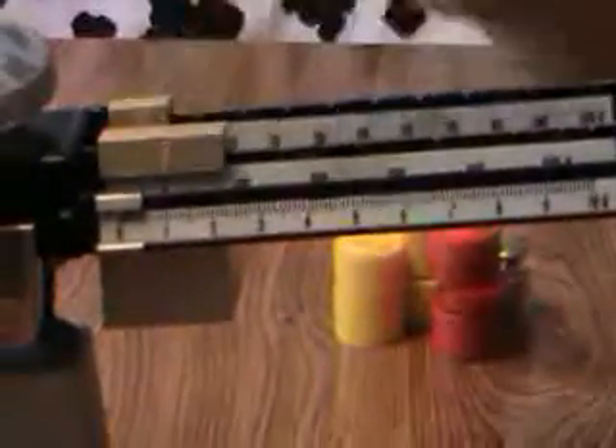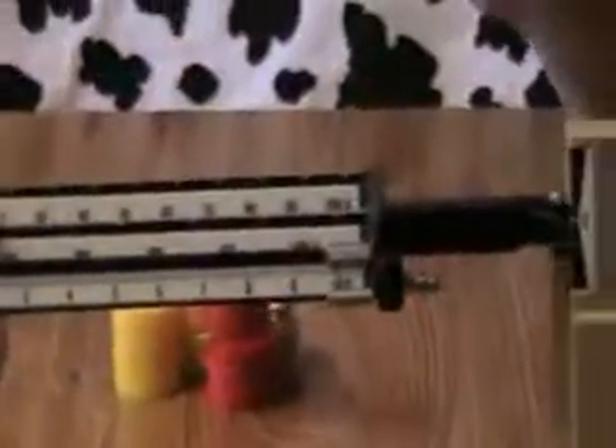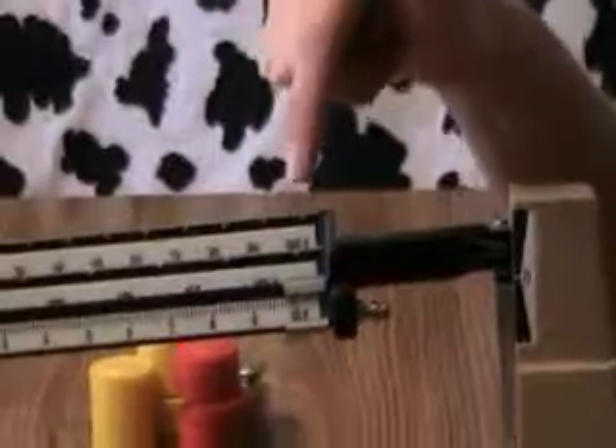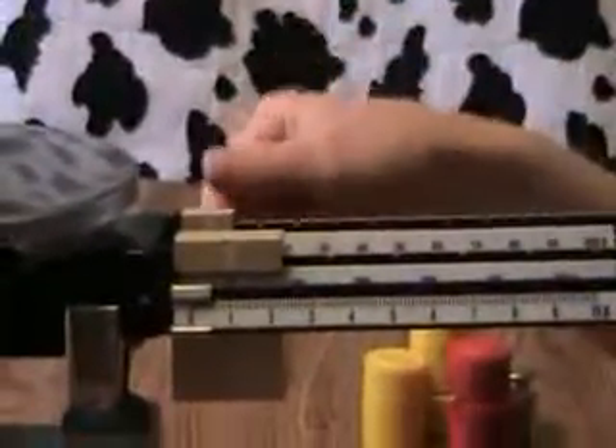Always start with your ones. In this case, I've moved it all the way over to ten grams and my object is still too heavy. So I'm going to move it back to zero, and I'm going to use the back beam measuring by tens.